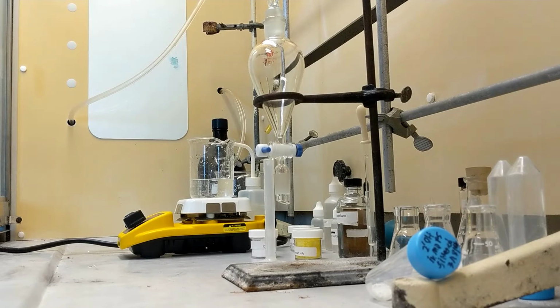The purpose of this experiment is to introduce the macro-scale technique for performing extractions and allow you to practice this technique. This experiment also demonstrates how extraction is used in organic experiments. Alright, with that being read, let's go ahead and start with Experiment 3A, which is extraction of caffeine.